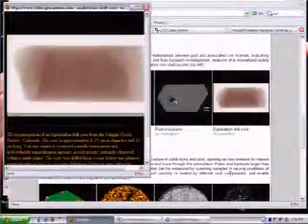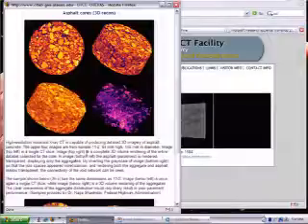In this case, you're seeing a plane inside of this core, and those little red flecks are actually gold. So that's one of the kinds of geological samples that we do. We also do a variety of engineering samples.